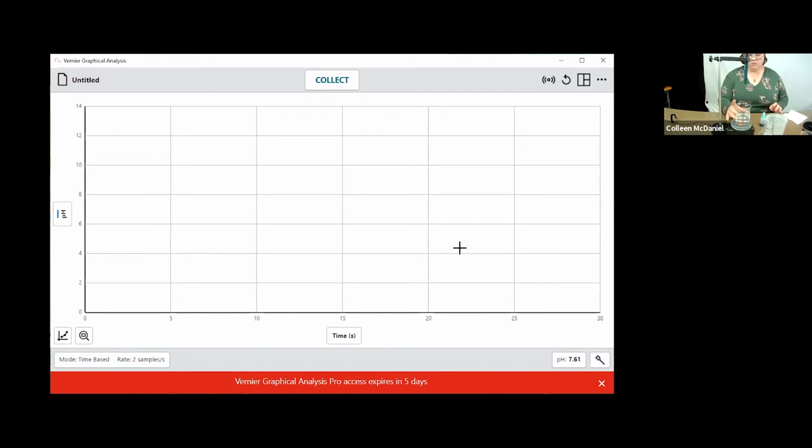What I have is a beaker with 100 milliliters of distilled water. And just to add to this demonstration, I'm going to put some bromothymol blue in this. Now, bromothymol blue is often the reagent we use in biology where we're doing photosynthesis experiments and stuff. Well, bromothymol blue is actually an acid indicator. So what this is going to indicate is our sample becoming more acidic because of carbon dioxide. A lot of times we don't think of it being that way. We think of it as showing photosynthesis or cell respiration.